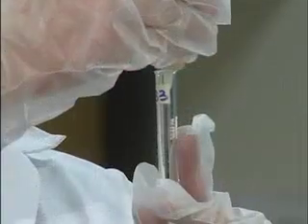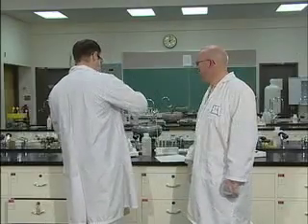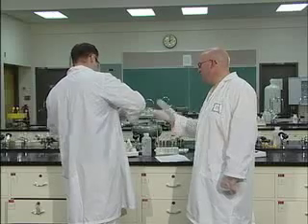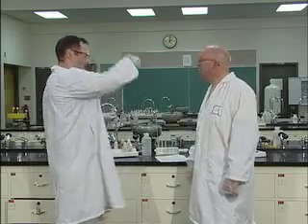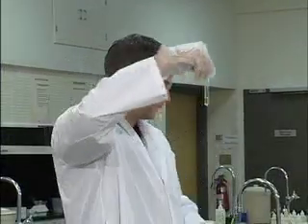30. So we're going to put 30 drops in here. How much is that, just gauging? Gauging, that looks like about 6 milliliters or so, about an inch and a bit high. Hydrochloric acid, not water.